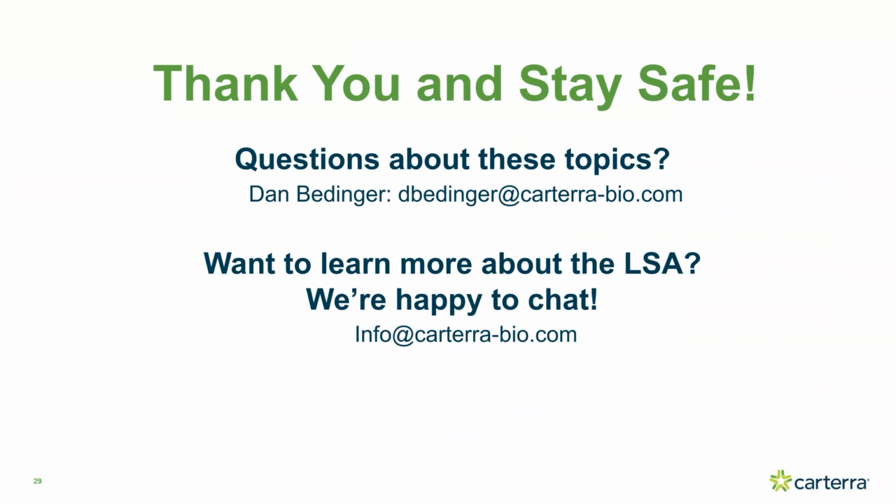So that's the ultimate test to see if you're having mass transport, if you've immobilized something at multiple densities over a broad range to look at the kinetic fits and see if your apparent on rate changes dramatically across those, then you know that you were having a mass transport limited system. If it doesn't really change, then you know that you're in a kinetic zone, or the diffusivity of your antigen is such that it's not causing that problem.